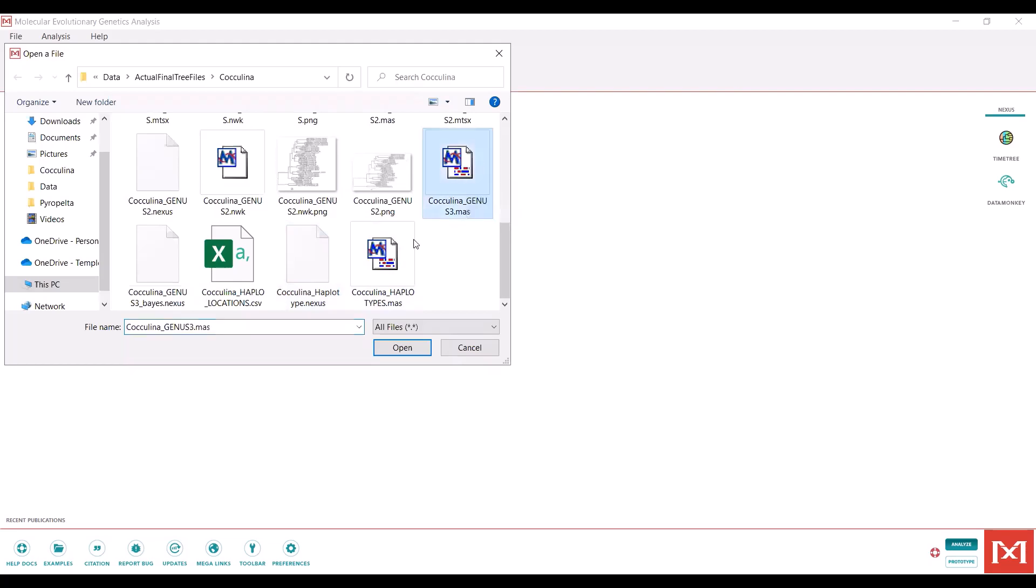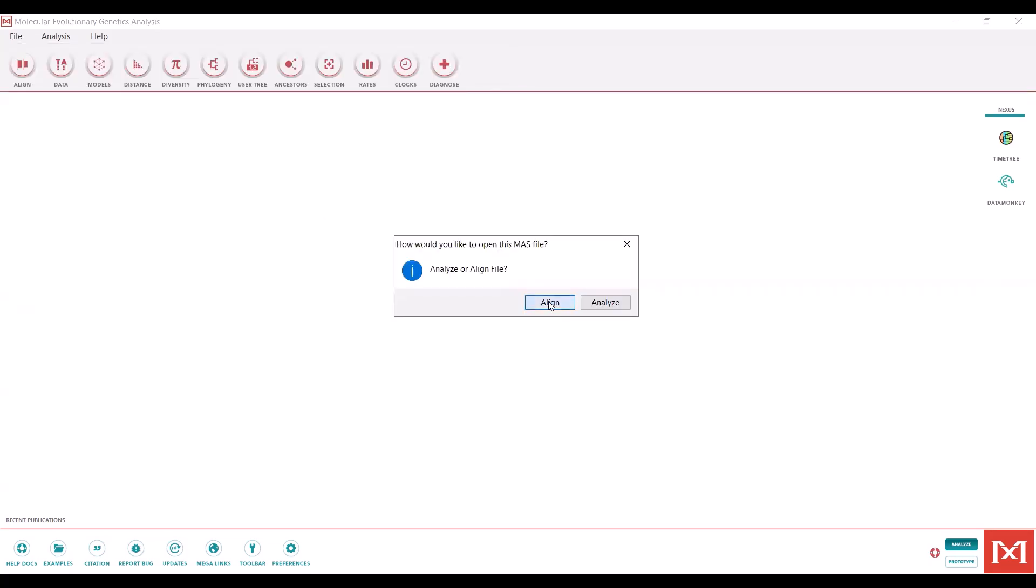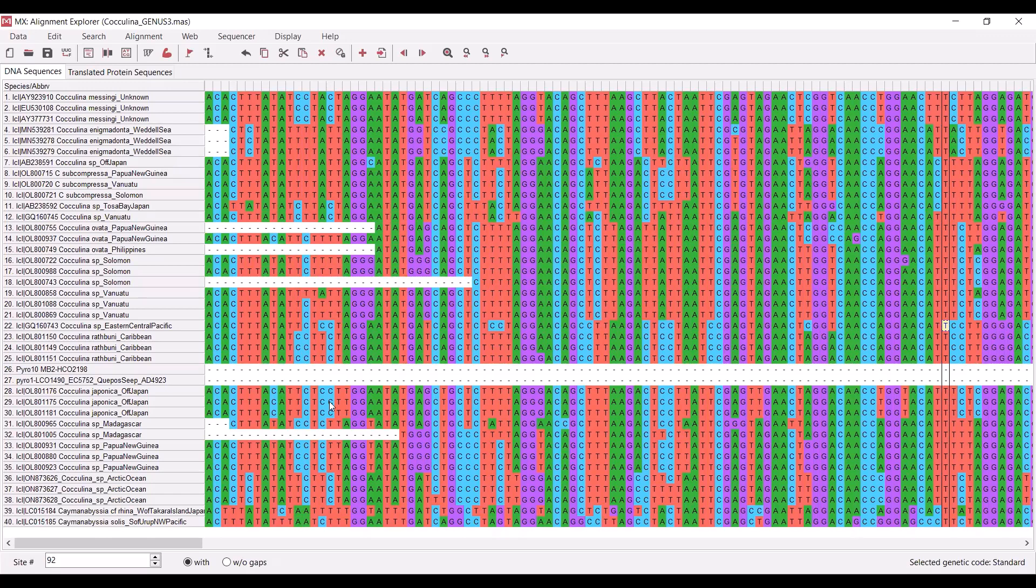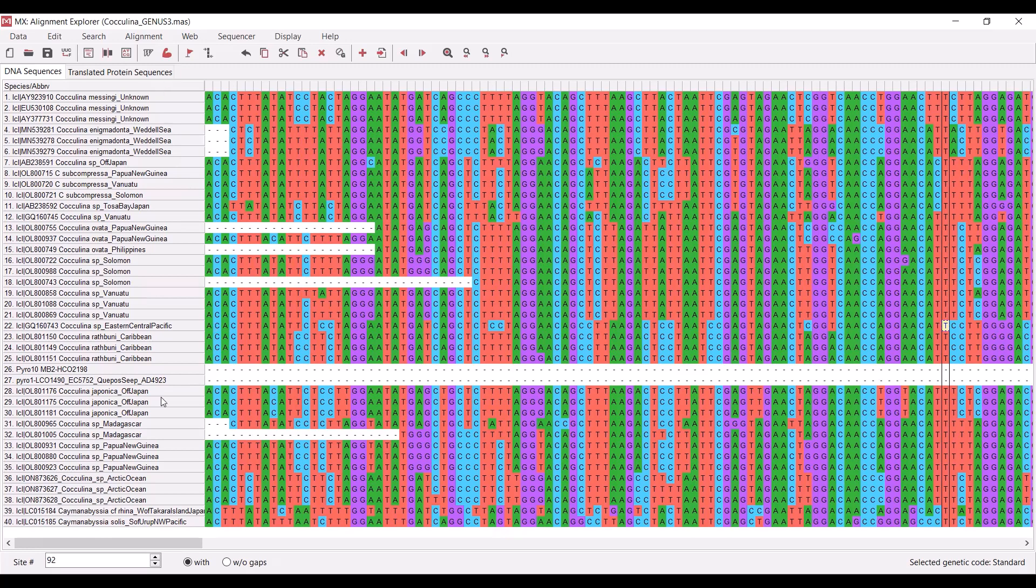For instance, I am going to be analyzing this file today. Whether you're building an alignment from scratch or opening a file you already have, you'll see all of the sequence names here and all of the sequence data to the right. This is an alignment I have of 40 sequences. You'll notice these are already aligned.